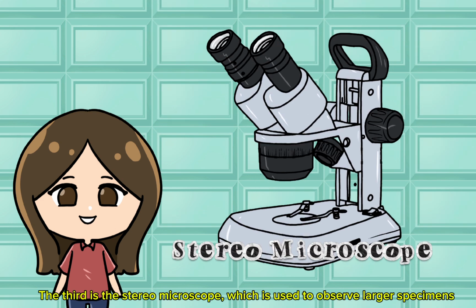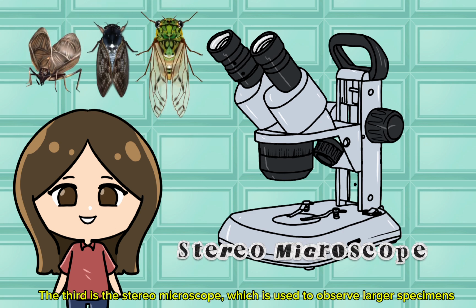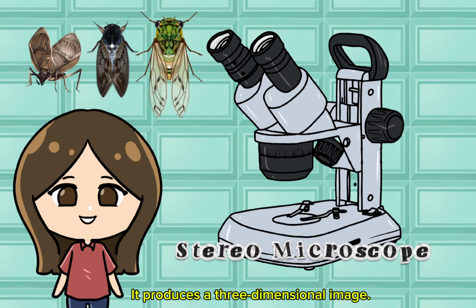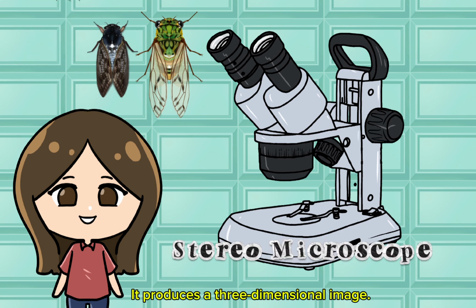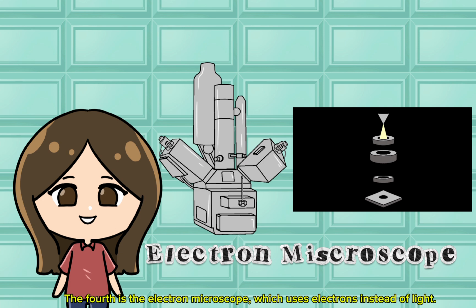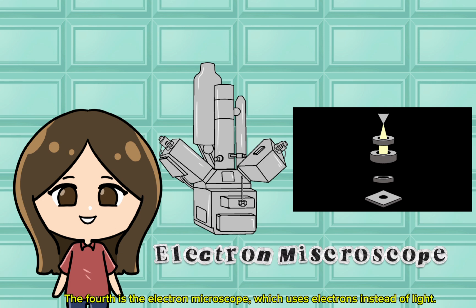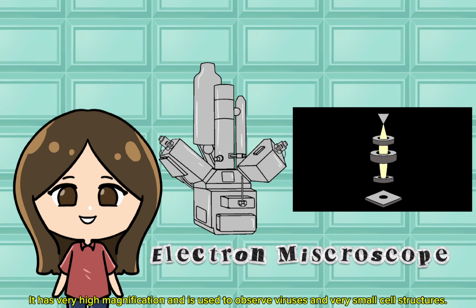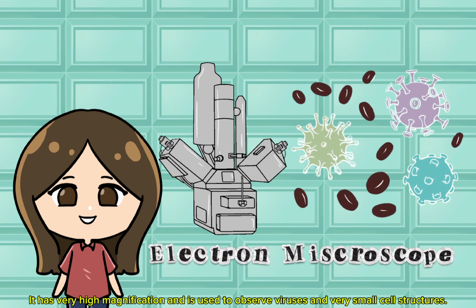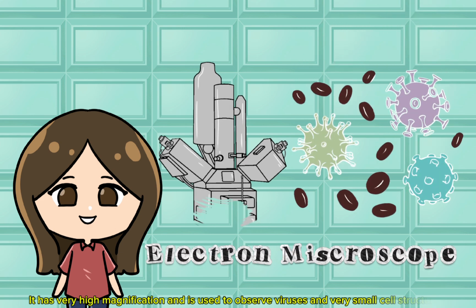The third is the stereo microscope, which is used to observe larger specimens such as insects and plant parts. It produces a three-dimensional image. The fourth is the electron microscope, which uses electrons instead of light. It has very high magnification and is used to observe viruses and very small cell structures.